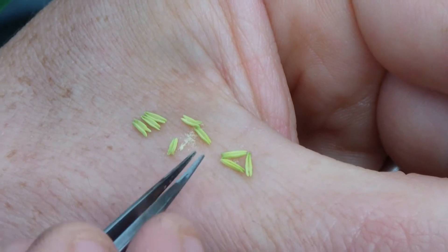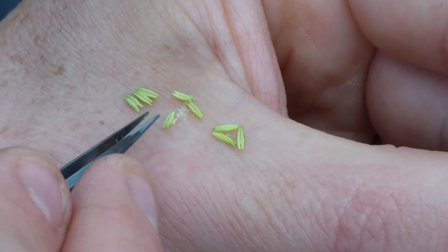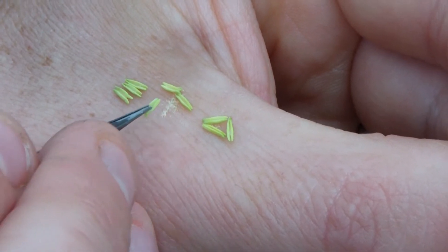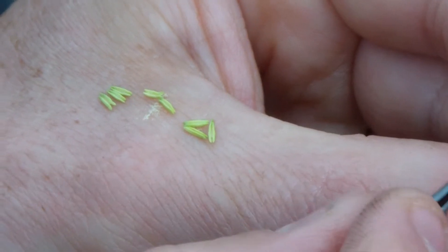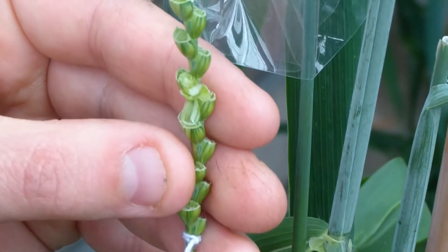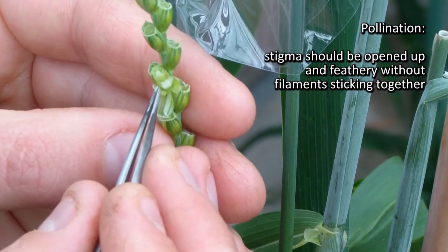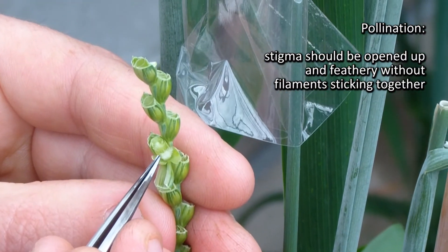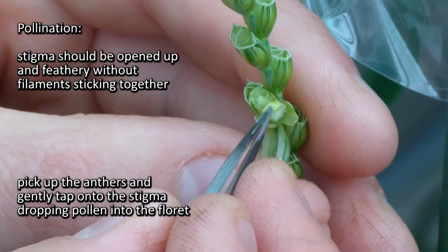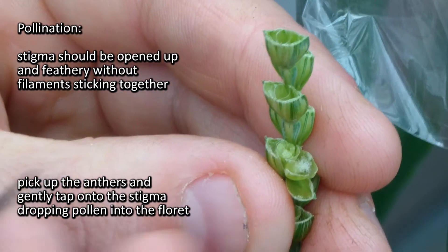This is exactly what we want to be seeing — anthers arriving on my hand perfectly intact, and the heat from my hand being enough to split them, to excite them and split the anther open, then leaving pollen on the hand. This means the pollen is perfectly at the right stage. What I'm going to do is take this pollen and put it onto the stigma. This is the perfect stage for a stigma — it's opened itself right up, it's showing itself to be very feathery, no sticking together of the filaments, perfectly fluffy.